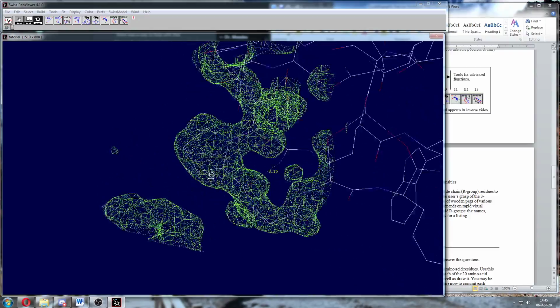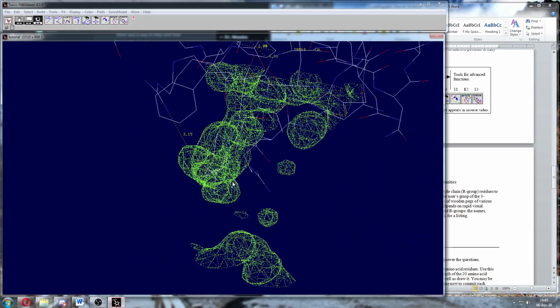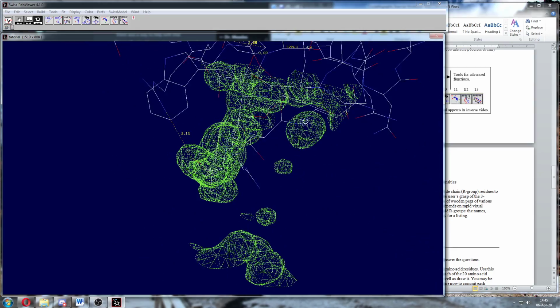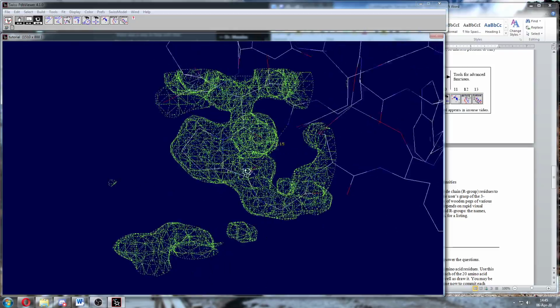and there's no empty density anywhere. And some of you, really eagle eye, are pointing out, like, what is this big blob sitting out here then? And you're absolutely right. There's a blob here with no atoms assigned to it. We'll get back to what that guy is in a second.